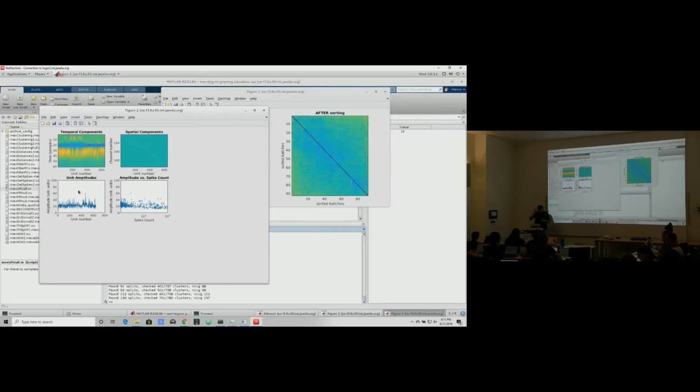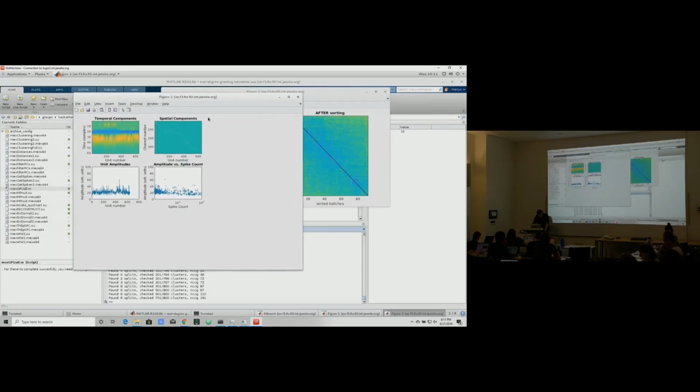for every unit, they get sorted by their spatial location, and so that's why the spatial components all look like that, kind of arranged in a line. So we can tell from this line, for example, if you look over here, that it skips some channels. Presumably because those channels didn't really have much activity, so there weren't really any units found there. So it kind of skipped to the next set of good channels and continued that way. Okay, so those are the spatial components.